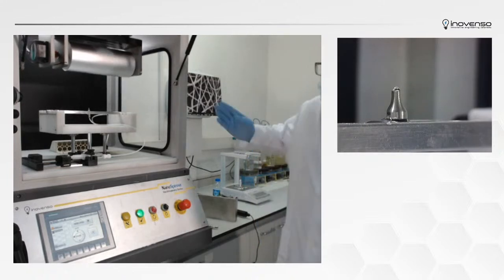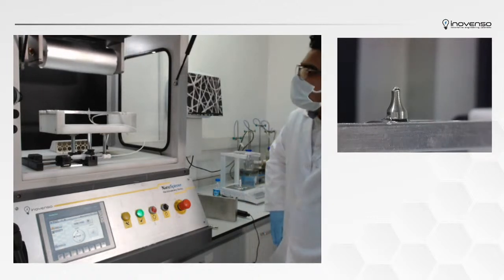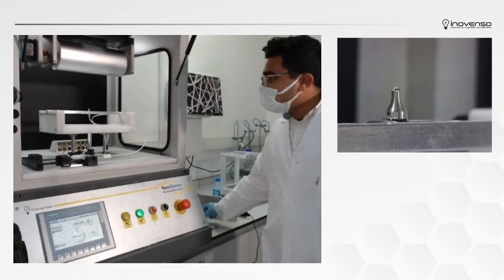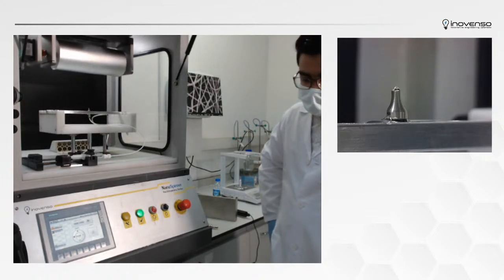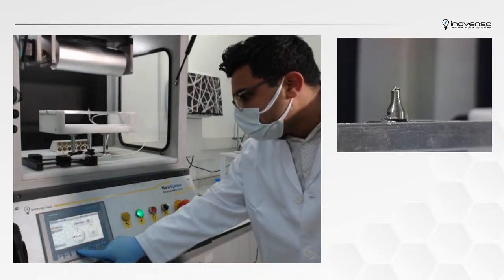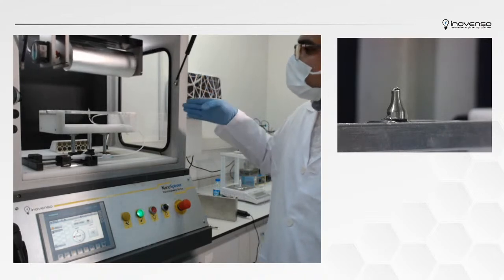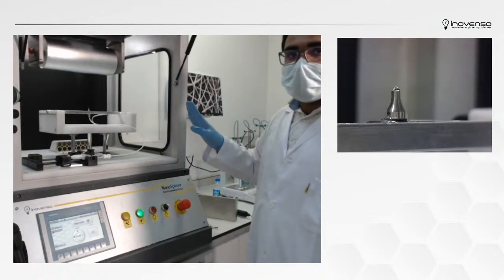Let's see if we can get a good image of the process. You can see about 2 or 3 jets that are being formed. Again, this is a multi-jet electrospinning system. The standard needle wouldn't allow that. This is for high throughput while maintaining a very low fiber diameter. So this is the basics we covered: the spinning distance, the rotation of the drum, and the electrospinning.